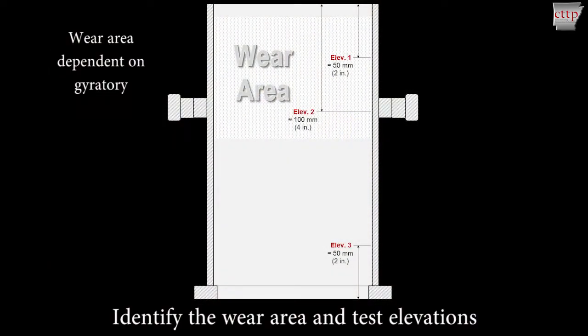Identify the wear area and test elevations for your mold. If the gyratory ram comes down from the top, the wear area will be in the bottom portion of the mold. But if the ram pushes up from the bottom, the wear area will be in the top portion of the mold.